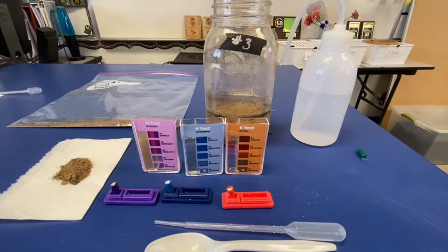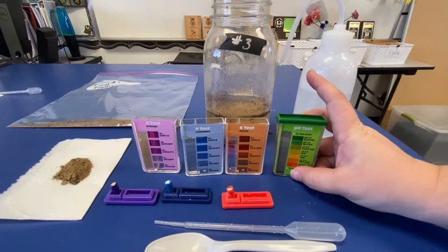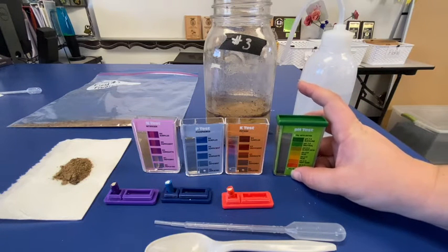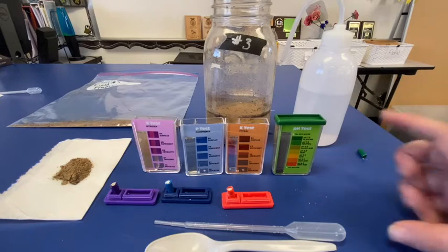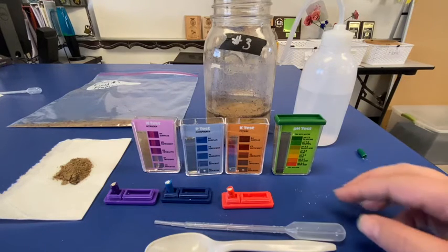As I'm shaking, once again, this is going to be for pH. It gives us that paper on the outside, which will show us the color indicator it changes, such as between 4.5, pretty acidic, to up to 7.5, where it's alkaline. I'm going to let this sit for 1 minute so that we can see what the pH of that soil is. As we go, I'm going to start walking through the other portions.